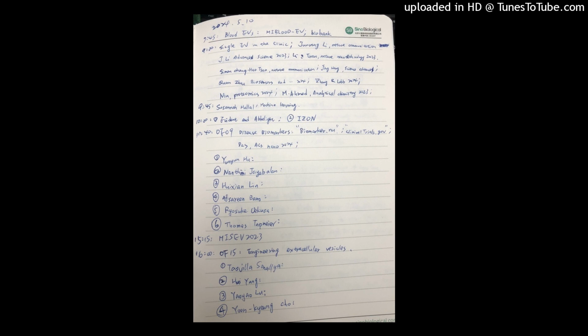Overall, we found that all these candidate proteins can indeed serve as potential markers for at least one subtype of breast cancer. However, for single protein markers, no matter through the proportions or MFI, we can neither differentiate EVs from 3 different BCA subtypes, nor distinguish between BCA EVs and EVs from other tumor regions or normal cells, such as the red blood cell. Thus, we have to involve more parameters and return to dual protein analysis.